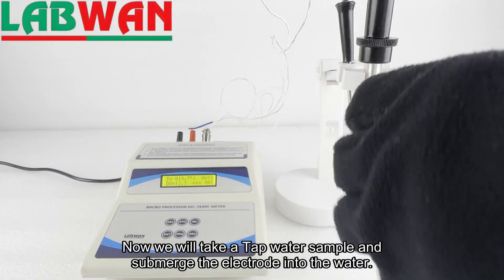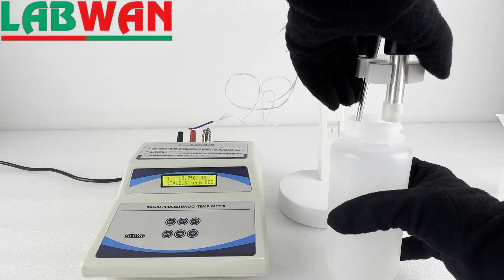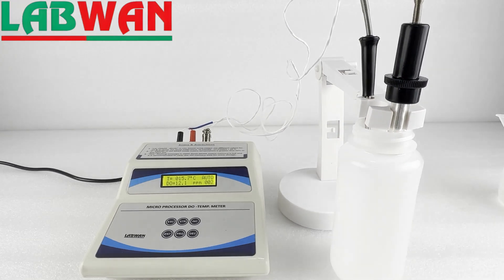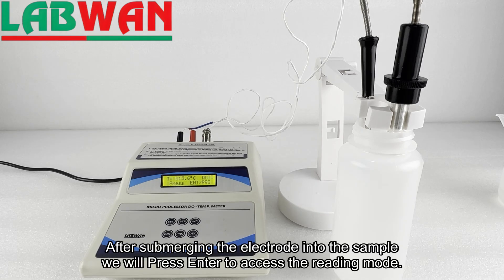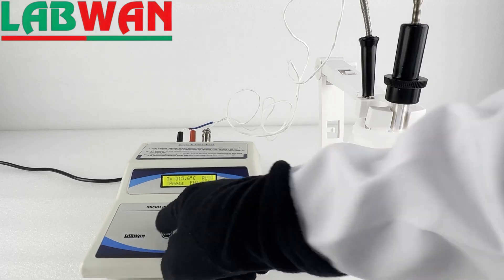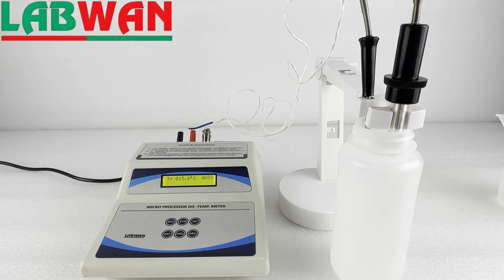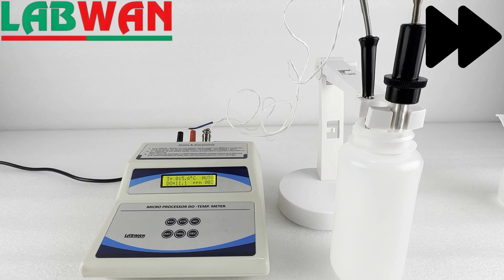Now we will take a tap water sample and submerge the electrode into the water. After submerging the electrode into the sample we will press enter to access the reading mode. In reading mode we will select the DO option. Now we will let the reading stabilize.